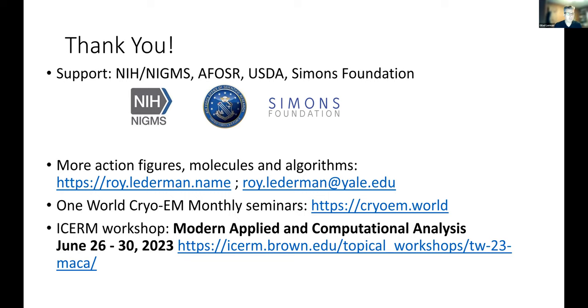And just as a small technical comment, you're using variational autoencoders. Did you try something else, like diffusion-type methods, to get better results? The original work on variational autoencoders isn't ours; we are using it in some of the methods. I have seen people use deep learning diffusion, I'm assuming that's the one you're talking about, to interpret some of the output of, say, CryoDRGN, but I haven't used it myself yet for this. Yeah, that's what I meant, deep learning diffusion. Just wanted to make sure we're talking about the same diffusion. Yeah.